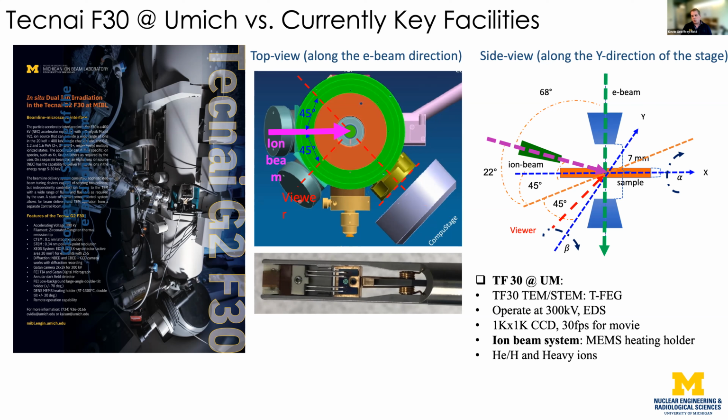And then we actually have a viewport where you can see things come in from the side here. That's this guy right here. And you would have these types of angles when you're trying to set up these particular types of experiments while also trying to stay in the correct diffraction vector. You also then have to think quite a bit about all the different angles involved.